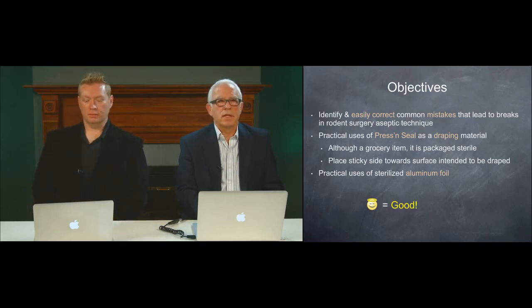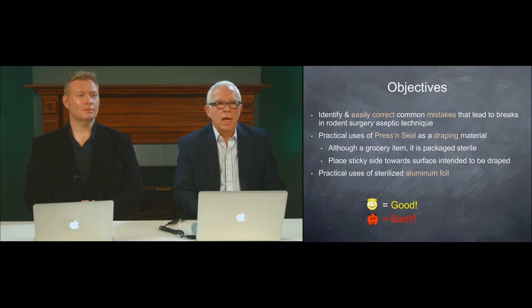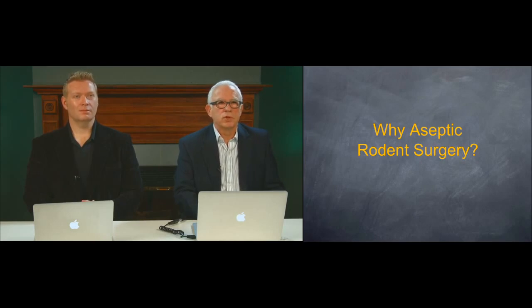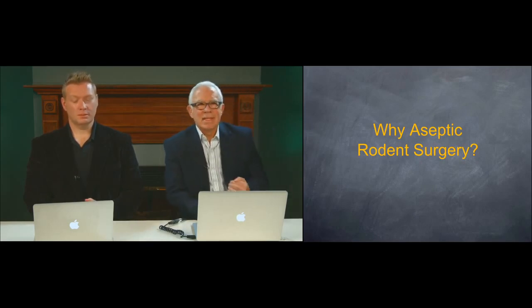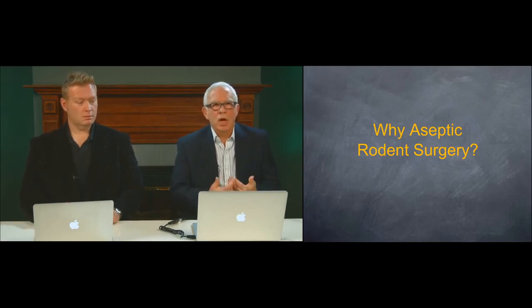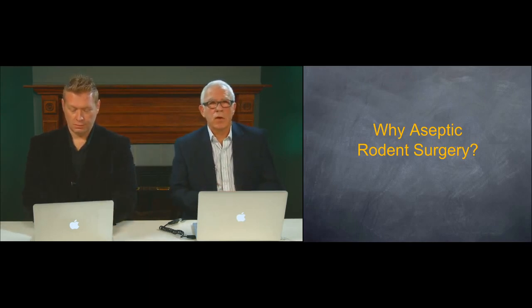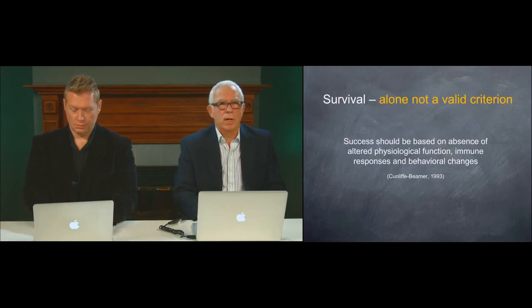In this presentation, we're going to show a number of slides where the good will be indicated by this little saint or smiley face, and things that are done wrong by this little guy called the devil. So first of all, let's talk about why aseptic rodent surgery. You have all heard it, because I've heard it repeatedly, that rodents don't get infected, or if they get infected, it's no big deal. So let's talk about it a little bit.